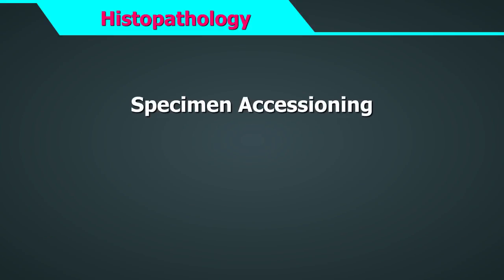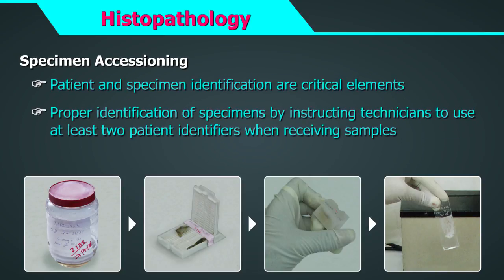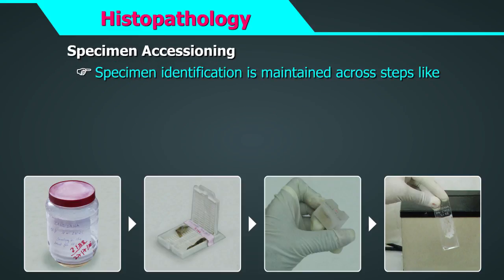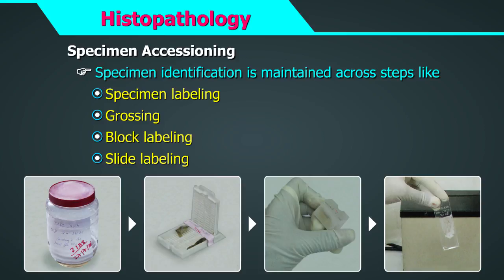One of the biggest challenges laboratories face is the ability to accurately label and track laboratory specimens throughout the lab process in order to avoid potential misidentification errors. Patient and specimen identification are critical elements in surgical pathology. Proper identification of specimens should be done by instructing technicians to use at least two patient identifiers when receiving samples. As there are multiple levels of tissue handling during which errors can enter, specimen identification must be maintained across steps like grossing, block preparation, slide labelling, etc. Laboratories can create their own customized checklists for the same.